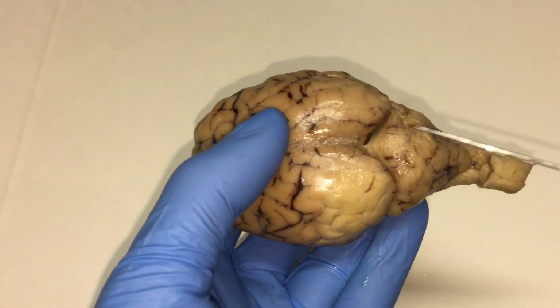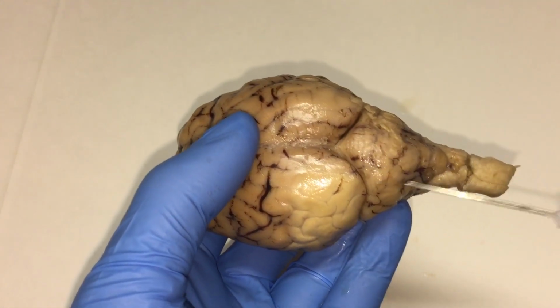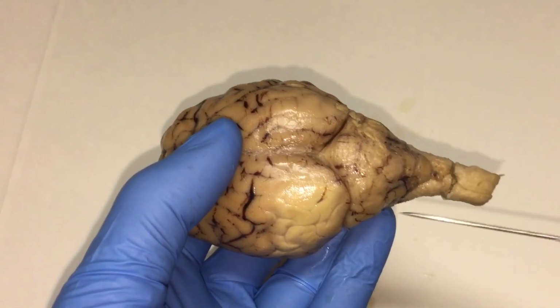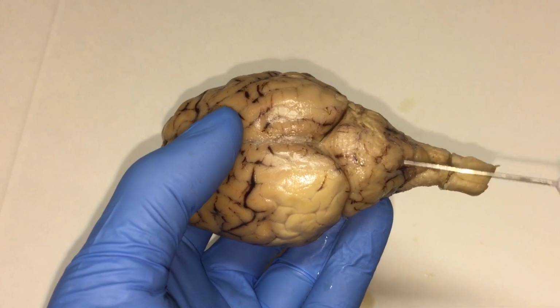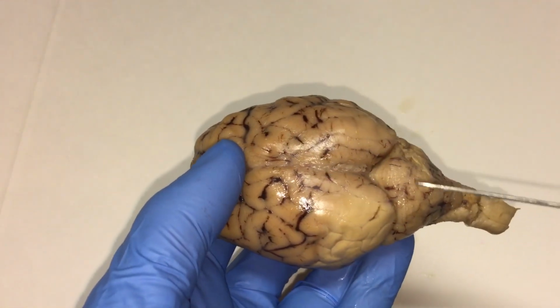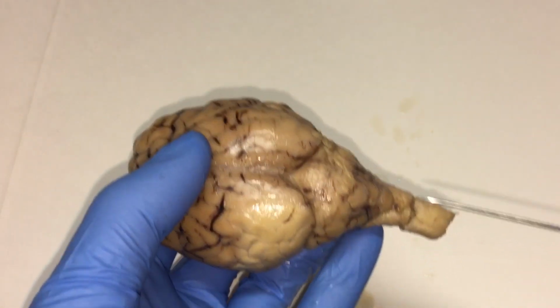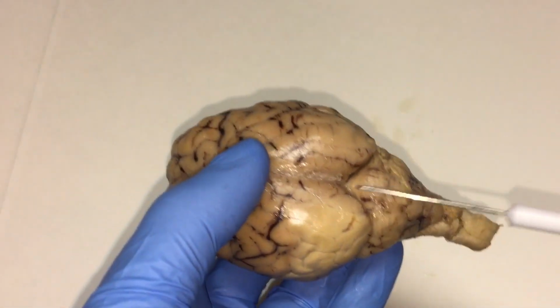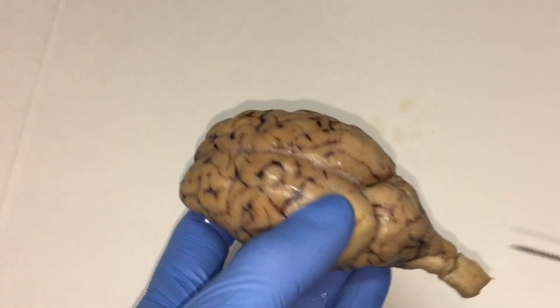Third structure I want to point out is right over here. This is the cerebellum, and this screens sensory input before it's sent over to the other areas of the brain. So this allows for control of fine movement for, in this case, the sheep.